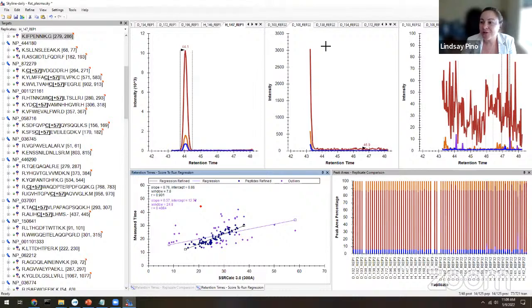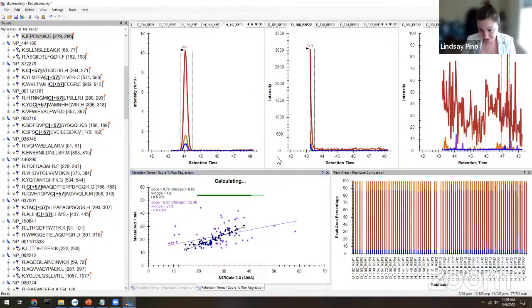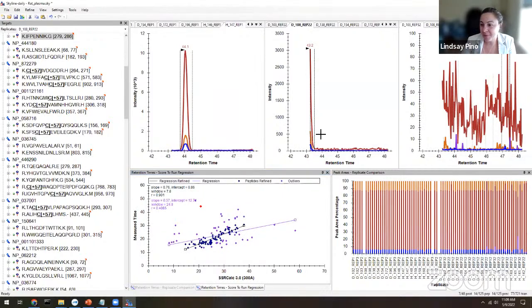This peptide got truncated. So this would be another example where I would manually want to curate this peptide. Maybe this peptide is truncated, so all of my statistical analyses downstream are going to be messed up because I don't get the full peak. So maybe this is an example where I wouldn't want to push this into a downstream statistical analysis because it's clear that the measurement has an error. This peptide has a measurement error.